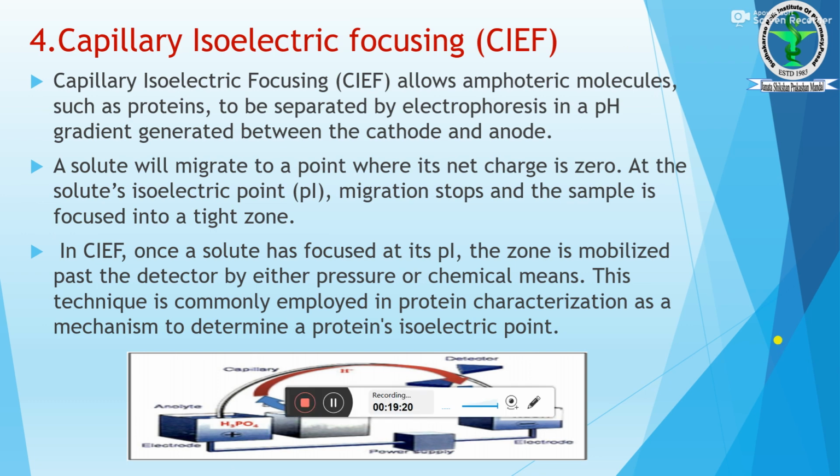Capillary isoelectric focusing, CIEF, allows amphoteric molecules such as proteins to be separated by electrophoresis in a pH gradient generated between the cathode and anode.